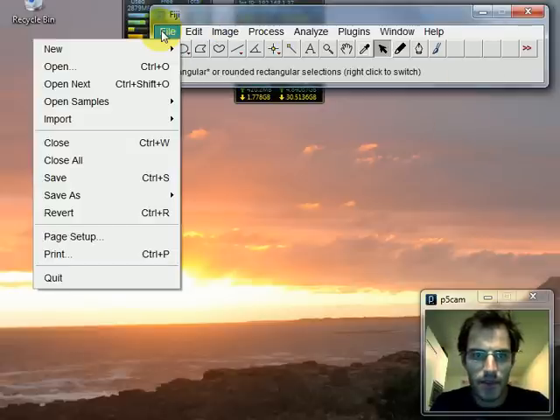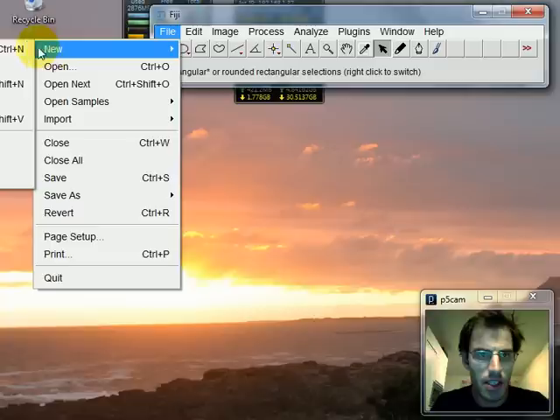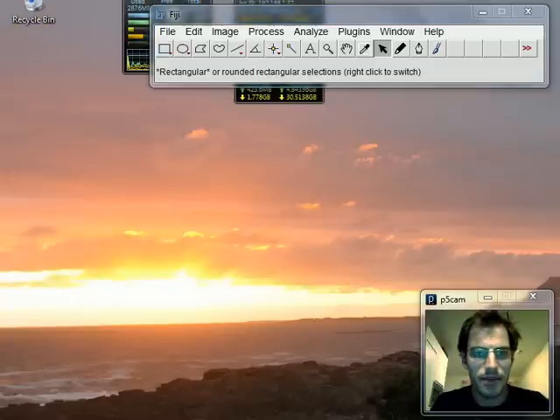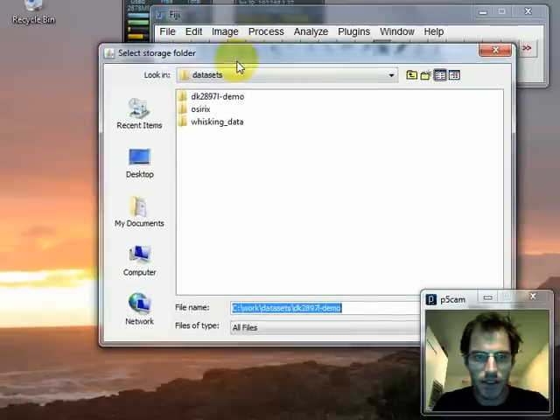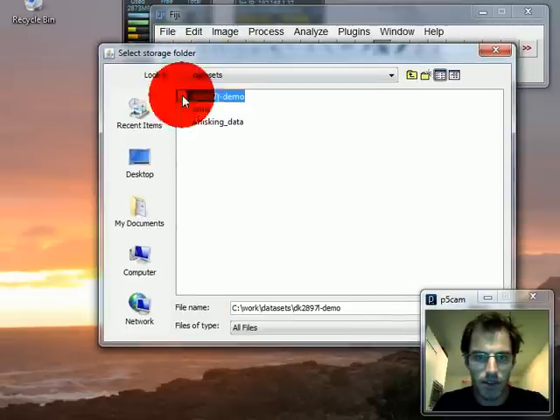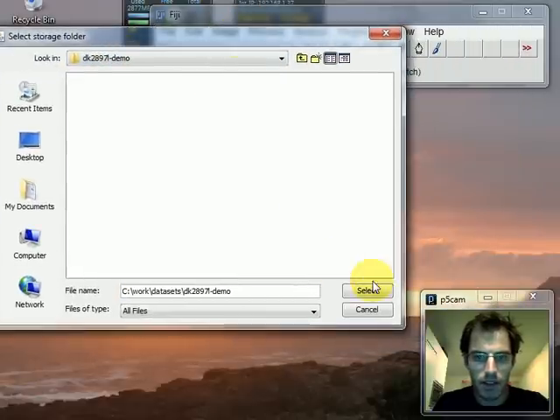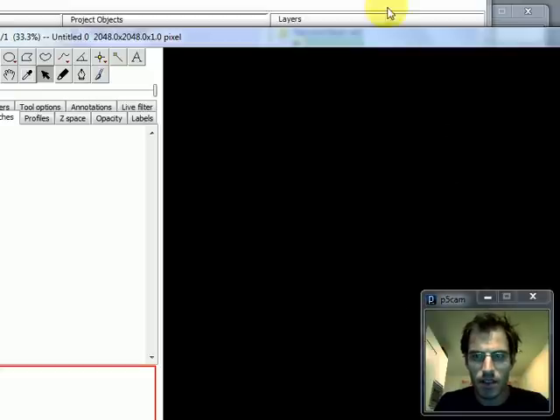Okay so here's Fiji. I go File, New, and then you can't see this but I select TrackEM2 blank. So then I get this. I have to select the storage folder. I usually just select my data folder.